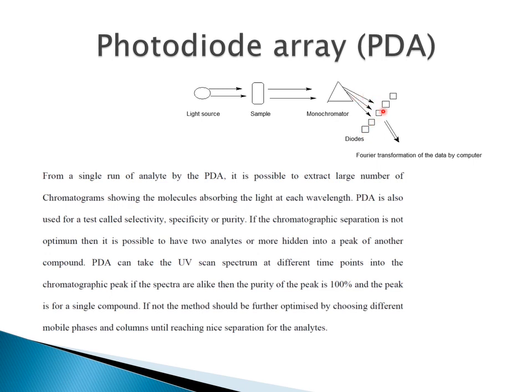So the idea is that we gain here all the absorbance beams across the whole UV and visible range, and this is one of the good technologies because we have so much data gained by these diodes.